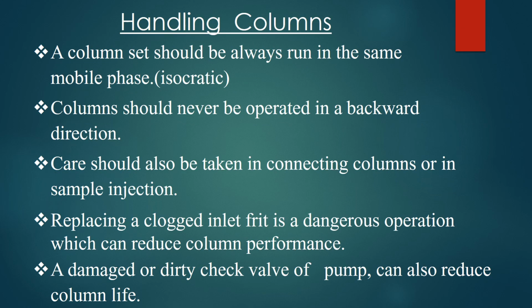Handling columns. A column set should always be run in the same mobile phase, that is isocratic. Columns should never be operated in a backward direction. Care should also be taken in connecting columns or in sample injection. Replacing a clogged inlet frit is a dangerous operation which can reduce column performance. A damaged or dirty check valve of the pump can also reduce column life.